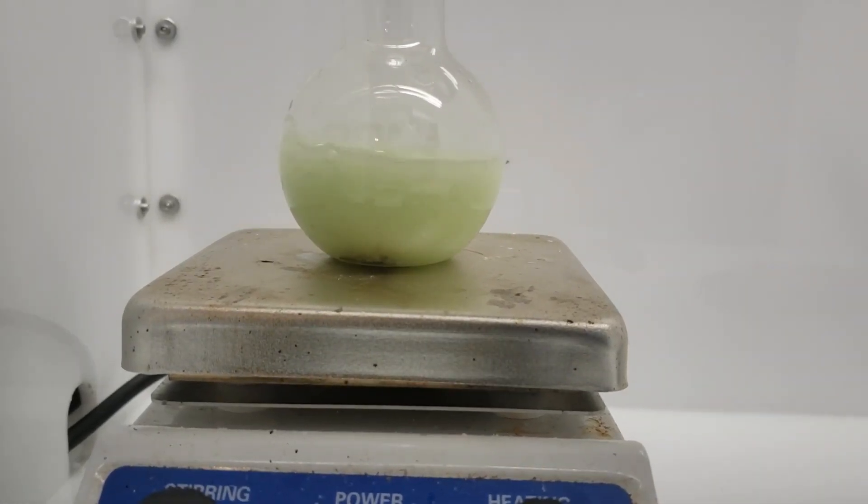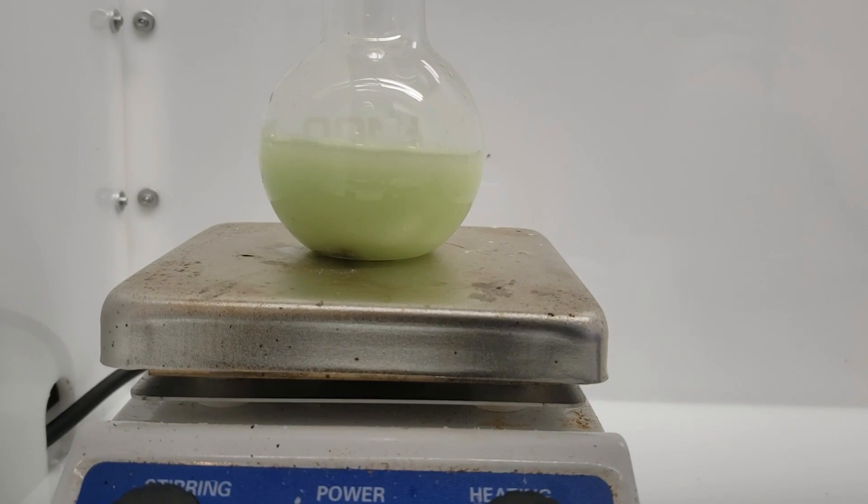An immediate and violent reaction ensues, releasing a lot of heat and bubbles of hydrogen. A slight green color also emerges. This is the color of Praseodymium chloride, which is formed in this reaction.